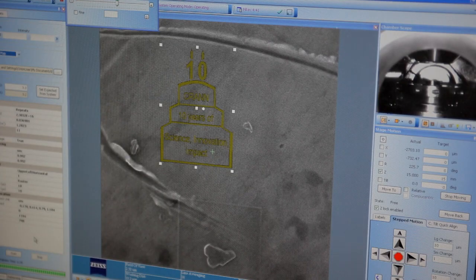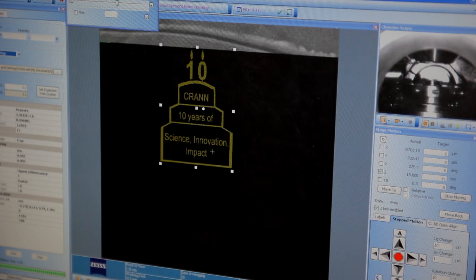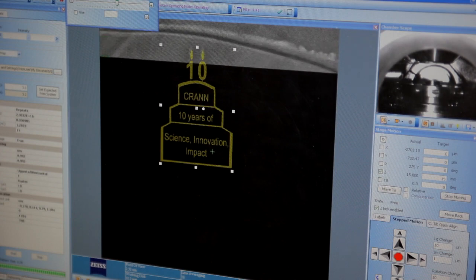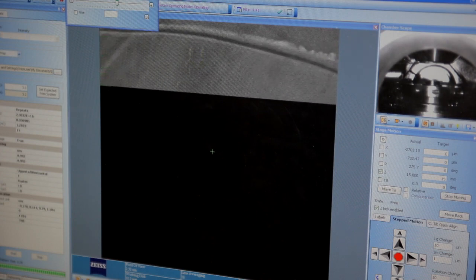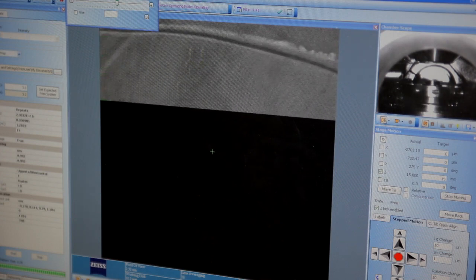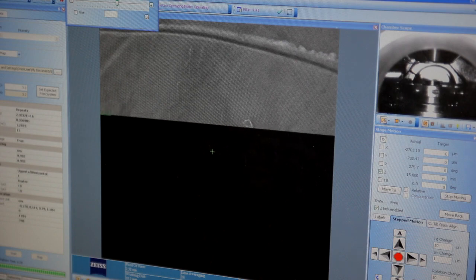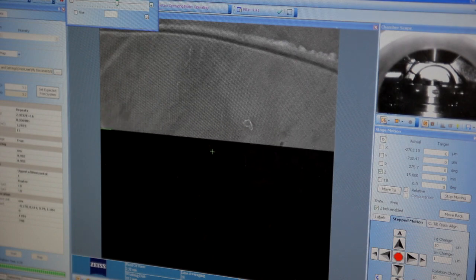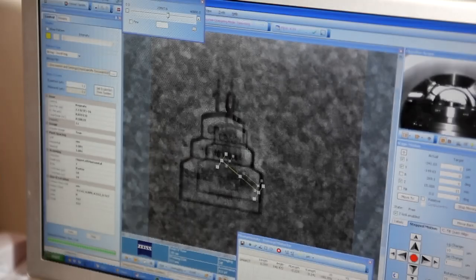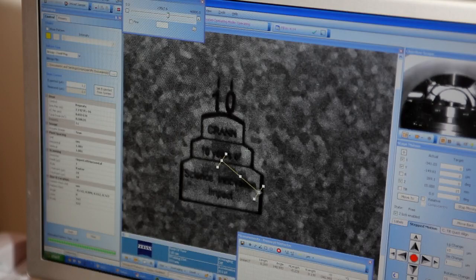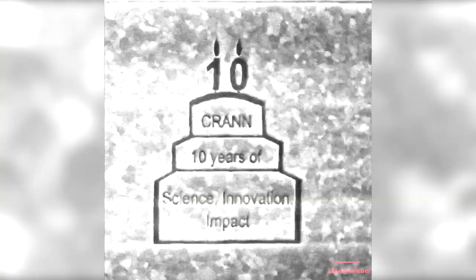At the moment we're patterning on the coin. What's happening is helium ions are being accelerated towards the coin. They're interacting with the atoms that are contained within the coin and they're kicking them out. What's been left behind is a pattern of the image that we want.